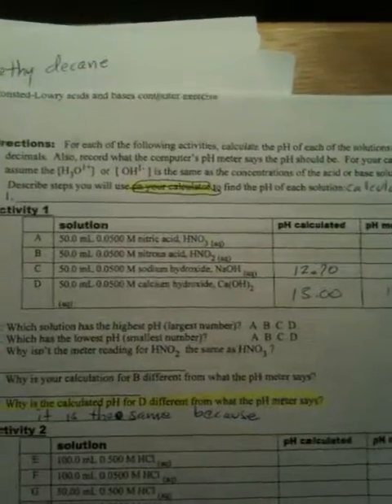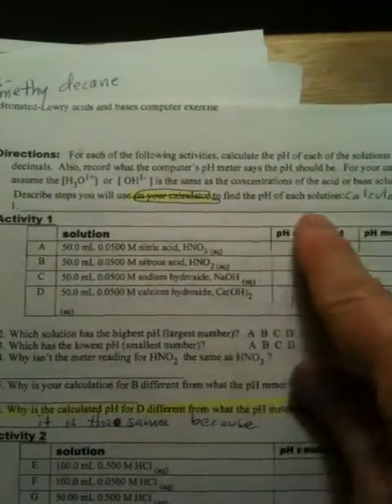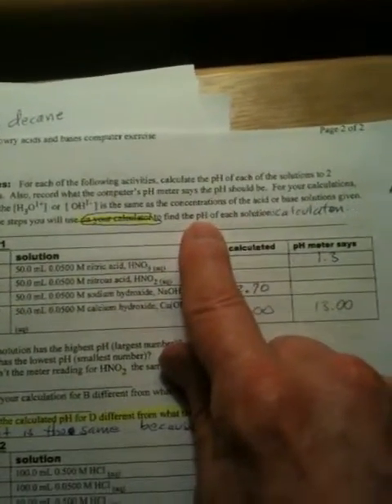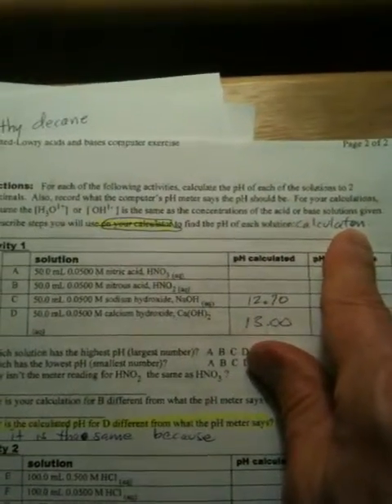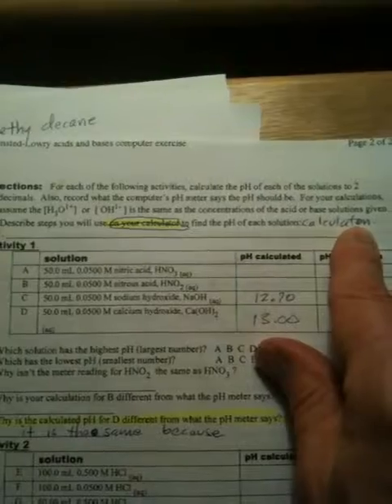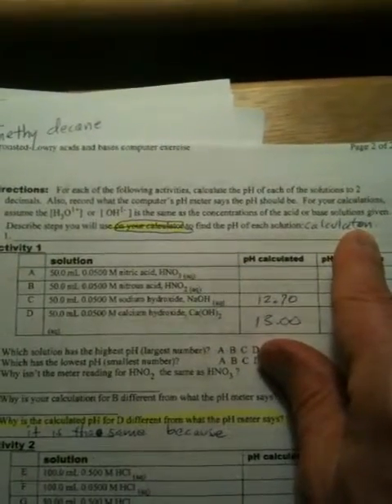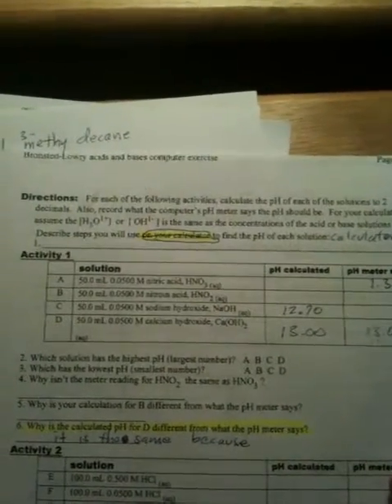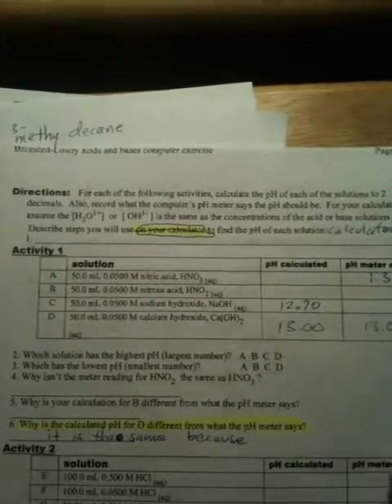And what I'm looking for right here is that you describe to me how you're going to find the pH of each solution and what your calculation is all about, how you do it. So you've got to talk about how we use the little chart to change concentration into pH. And what we're doing there, of course, is taking the minus log.